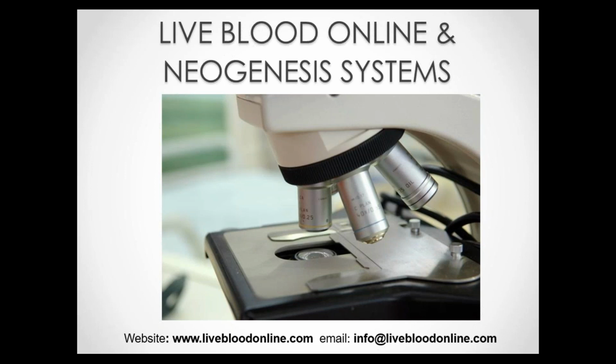And then somewhat related to the previous point, the third point is that live blood analysis allows you to monitor the efficacy of any given treatment. So because we're able to observe changes taking place in the body's internal environment or the terrain in real time, we can very easily monitor and track the patient's progress during treatment.